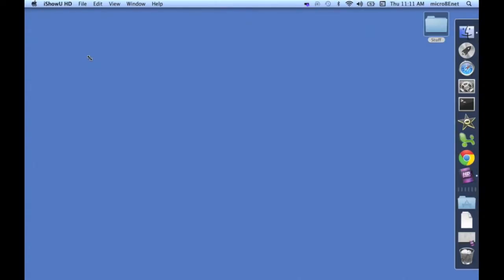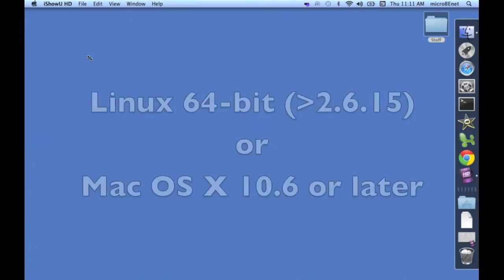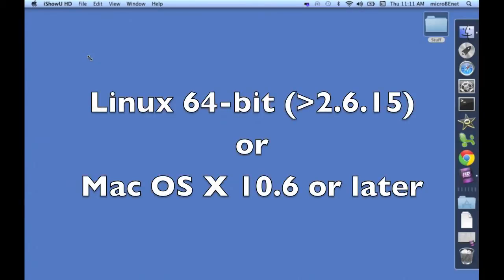This video assumes three things. Firstly, that you meet the system requirements for A5, which is Linux 64-bit or later, or Mac OS X 10.6 or later.